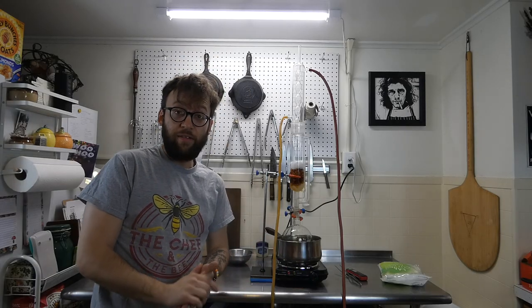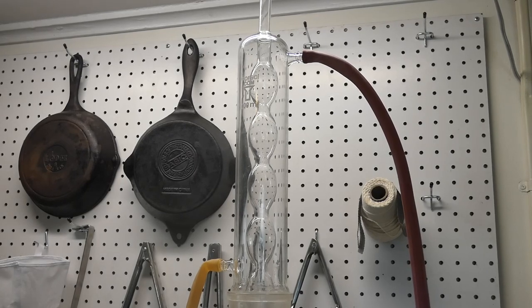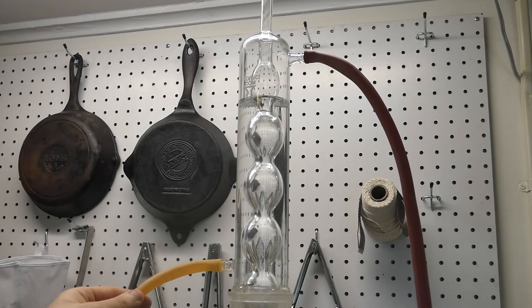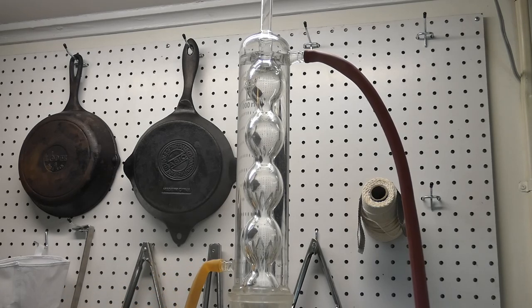All right, so the only thing we have left to do is to turn the water on for the condenser and turn the heat source on so this can start. All right, so you'll notice that the water fills up down here and works its way up to the top. And as it approaches the top, you'll see it start to flow into the out tube. And that'll go down and work its way back into the water system.